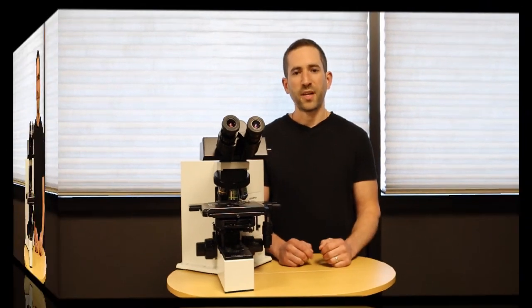So while you can have it, while you can still practice it, there's really no need when you have an LED microscope.